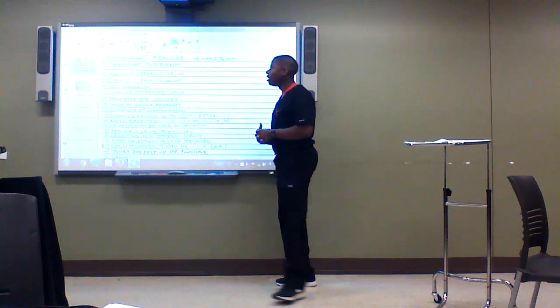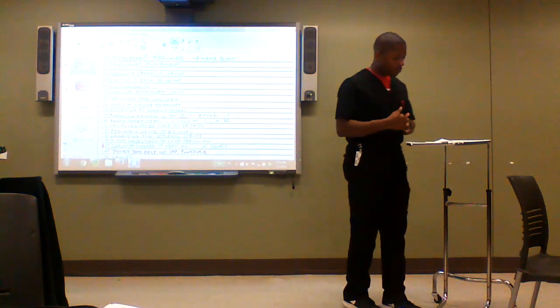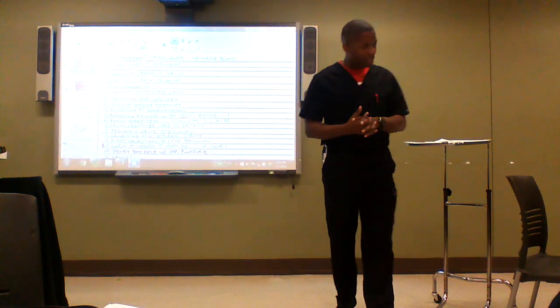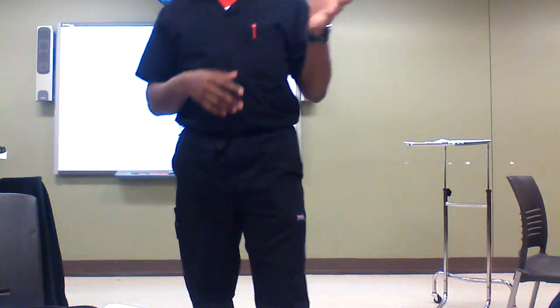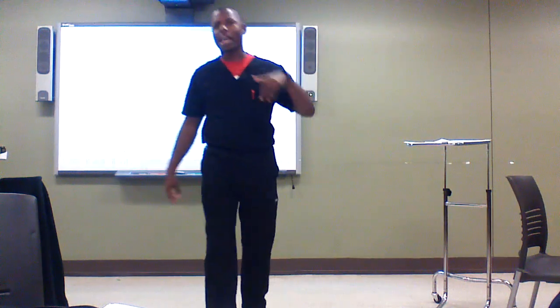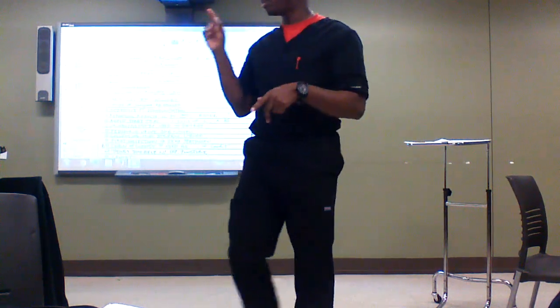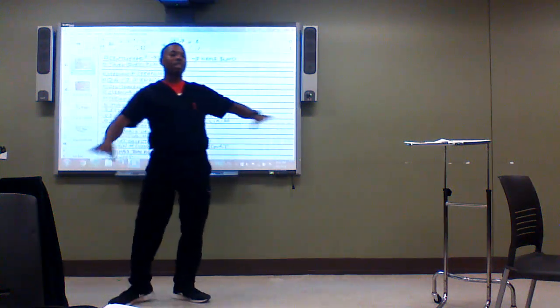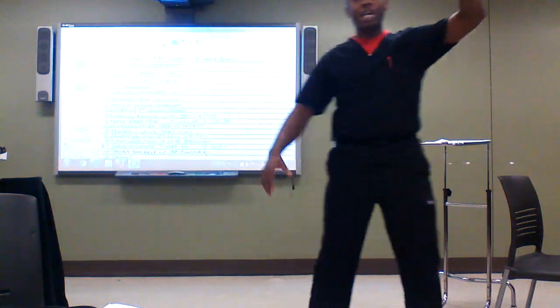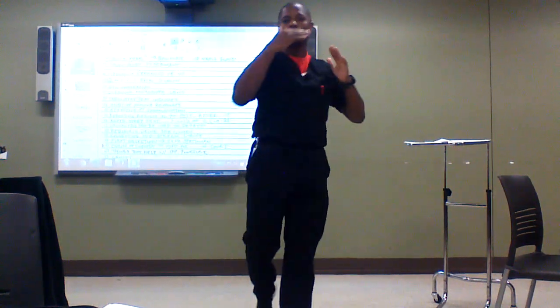Okay. Let's talk about the centrifuge. Remember when I turned it on, and what did it do? It started shaking and going crazy, right? Why? Balance. It ends with balance. Counterbalance. This is to say when it's counterbalanced, that means that if we got a tube over here, we need to have a tube over there. If we got a tube over here, we need to have a tube over there.